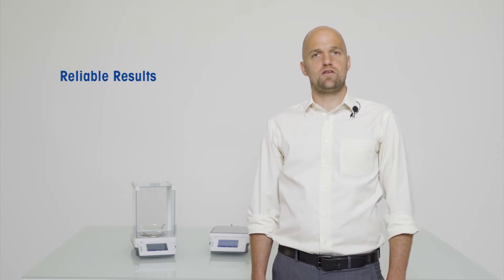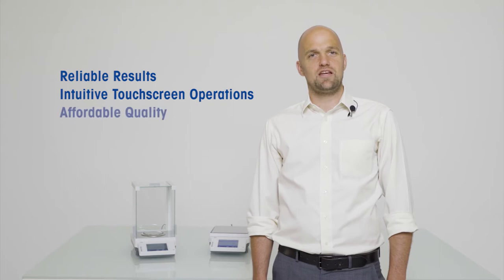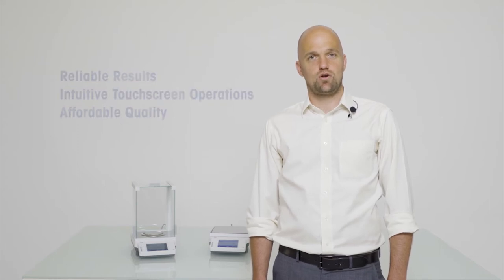These touchscreen operated entry-level balances feature high quality construction, solid performance to ensure consistent and precise weighing results, and best of all, MET balances are affordable even for those on a tight budget. Let's have a closer look.